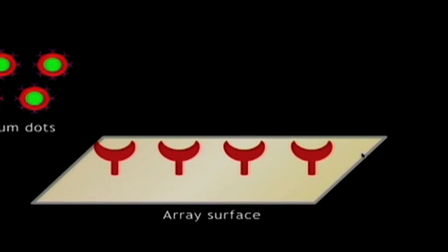In this interaction, we will see how quantum dots work. The inorganic fluorophores known as quantum dots have been developed that can conjugate with several biomolecules and be used for protein microarrays signal detection.